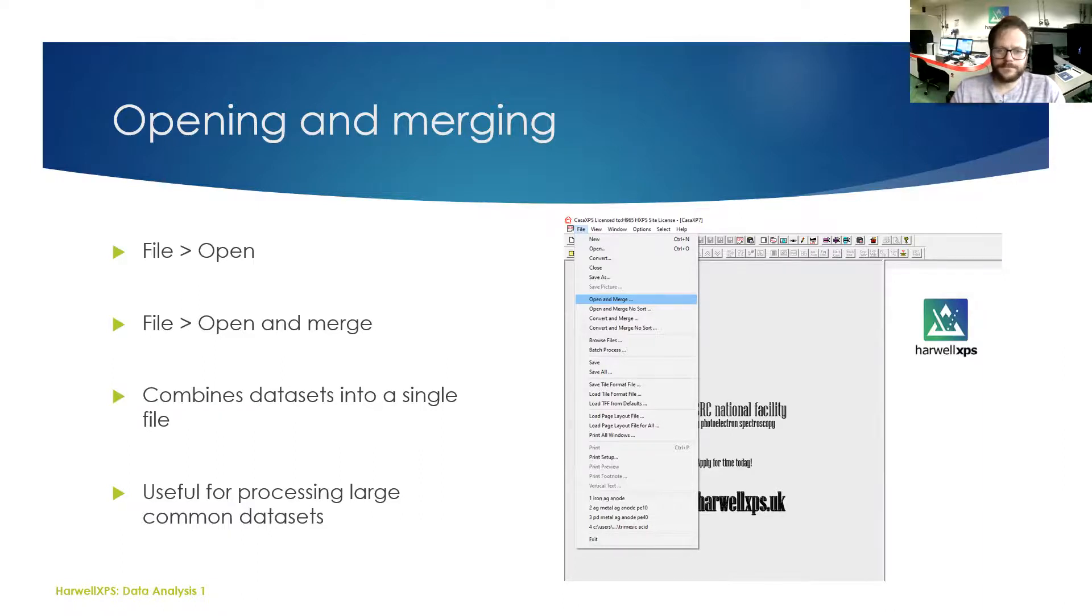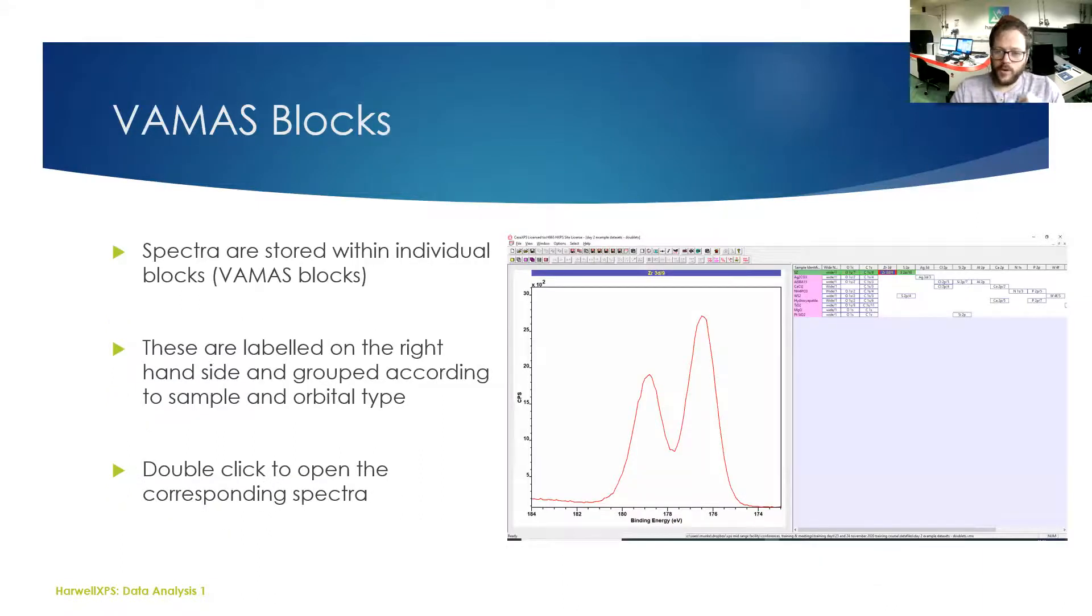A quick word on VAMAS blocks. You will probably hear this term used throughout this course. On the right-hand side here, we've got lots of different rectangles which have got the elements and orbitals inside. Selected here we've got zirconium 3d for the sample SZ. Double-click on any of these blocks and that will open up the corresponding spectra in the main window. Those are what the VAMAS blocks are and they contain all of the information about your spectra.